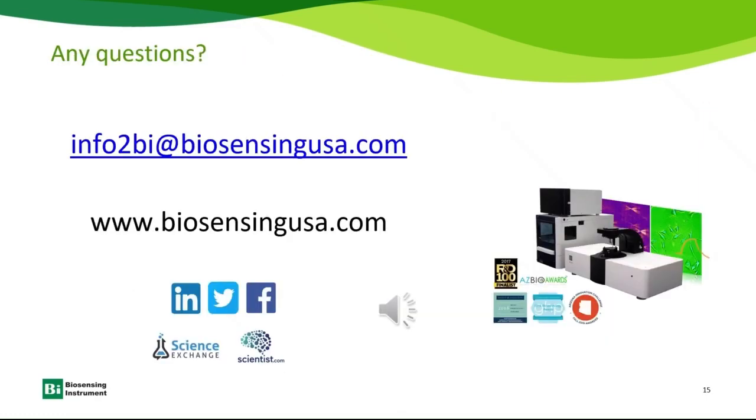Thanks for listening to this presentation. So in summary, SPRM is a very unique technique. It's a label-free technique that allows you to measure the binding between a compound and membrane proteins directly on the cell surface. So there's no need to purify the protein as you have to do in conventional SPR. With this, I will pass the time to Marie-Laure.